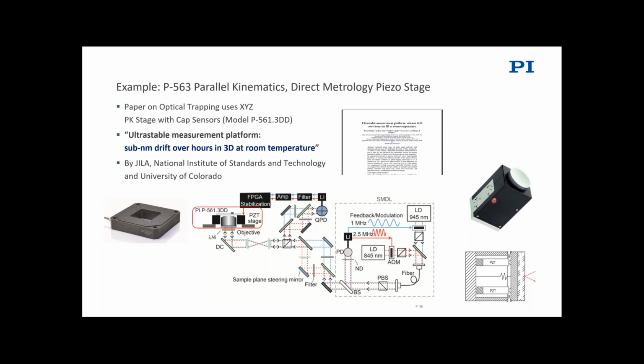Also, we often do piezo-based mirrors that can allow us to compensate laser positioning, and so to compensate drift with a steering mirror in a very precise manner.